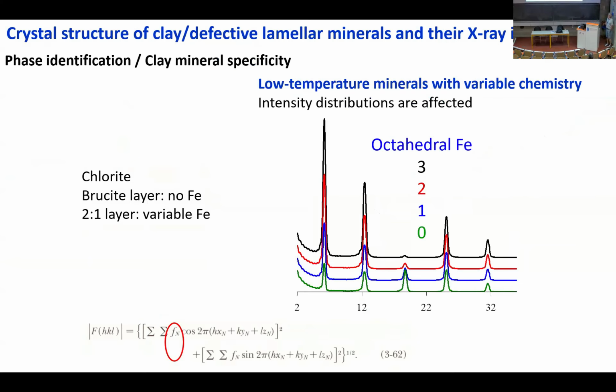Another thing that's related, which is fairly well known, but some of you may not know it, is that this is the expression of the structure factor I was speaking of. In the structure factor, what's written here is that we essentially have information of how many atoms of what nature, the nature being this scattering factor written here, are where in my structure. The where in my structure is essentially the X, Y, and Z coordinates.